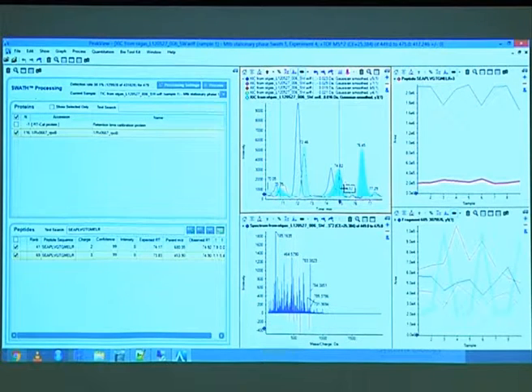So that's why it might be better to exclude bad intensity, and then you see, okay, that would decrease the area for the samples 3, 6, and 9, and you get a similar profile like up here. Also, the change here is maybe 15% or something like that. So depending on how good the assays and the data are, that might just be explained by the data itself. So it's not that huge a change, but still.